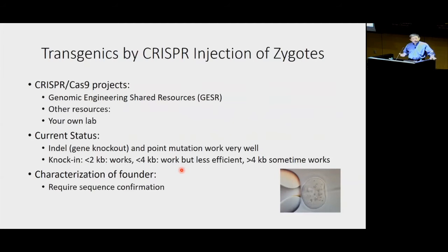You can still get it. Actually, we did some projects where we created mutations to knock in a fragment bigger than 4 kb. But we also have some cases that failed. This is consistent with other institutions' transgenic facilities.